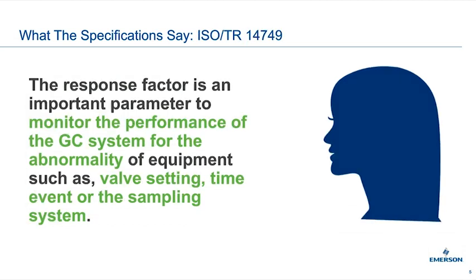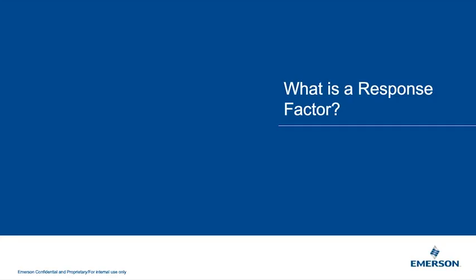Same thing, ISO 14749 actually has a little bit more details on response factors and their importance. They are critical for the monitoring of the GC for abnormalities with its valve settings, time events, and sample systems. And that's kind of true when we go through our examples towards the back of the presentation. We'll see how errors with valve setting or time events or even one sampling system can really show up in the response factors. And using that information can really pinpoint what we need to fix. So with that, we will begin with what is a response factor.